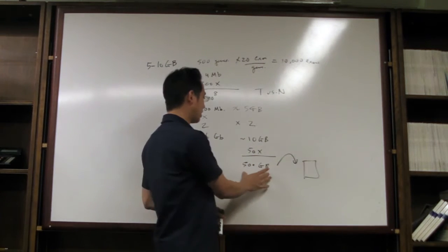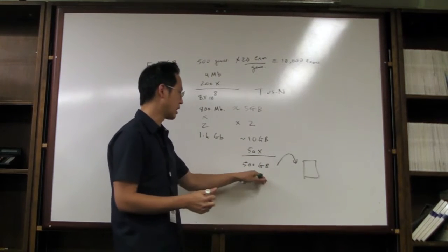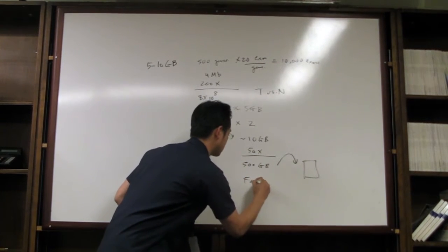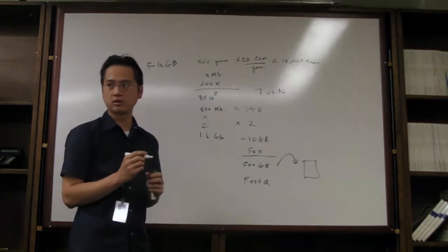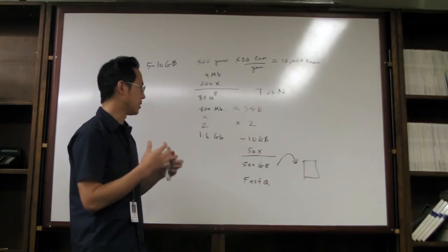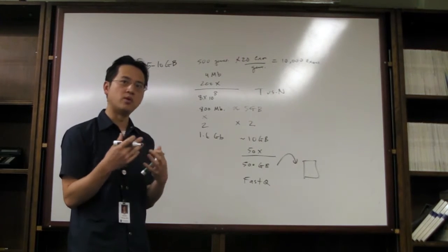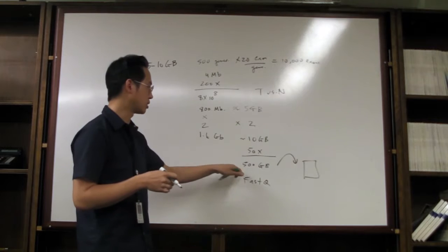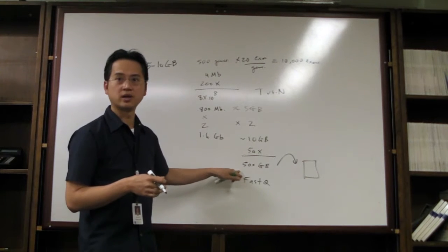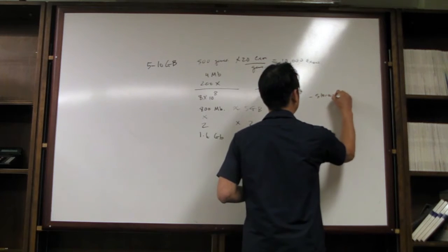So this is just to tell you that the data is quite heavy and intensive. And this is just the raw data, by the way. This is just the FASTQ files that you get out, and I'll explain what that is in a second. So when I talk about next-gen sequencing, the thing I worry and I'm most scared about is the informatics. And this is one component right here in terms of the analysis, is the storage. So one problem is storage.